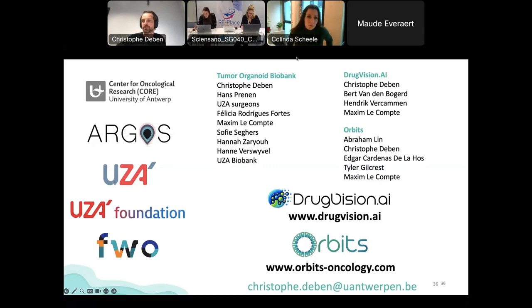And then I also had a small question, because you mentioned you were going to validate it, so I was wondering what the next step is for that? So now we mainly validate it in-house, so it's either the pipeline and the image analysis. We're trying to set up a couple of collaborations with other groups that will apply the method we developed to see that it not only works in our hands, but is robust and also works in other people's labs. And we will try to get more translational data where we link the ex vivo drug response to the clinical response and see what metrics are really important to translate the drug response in the lab to a clinical response.